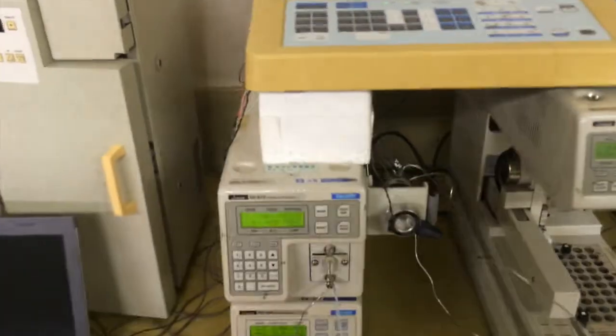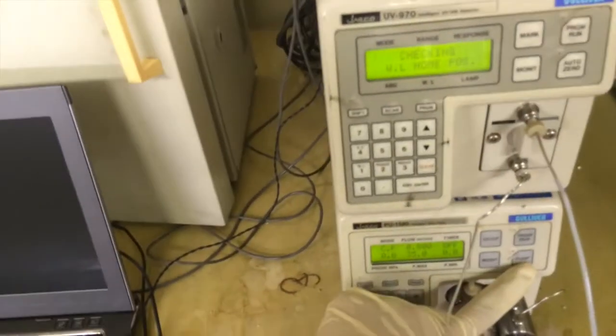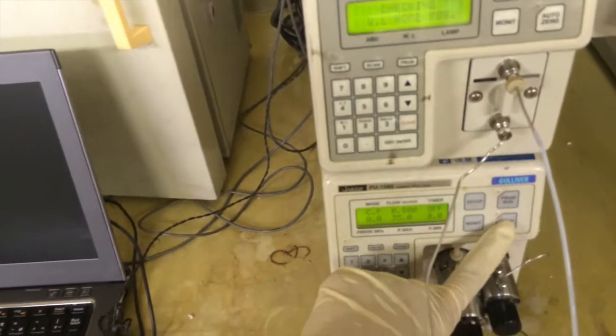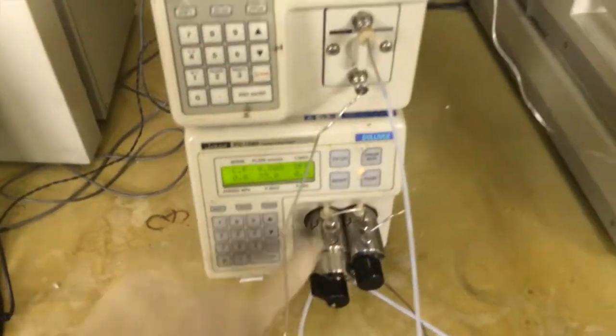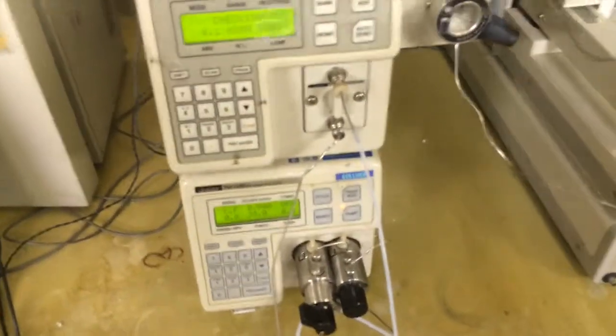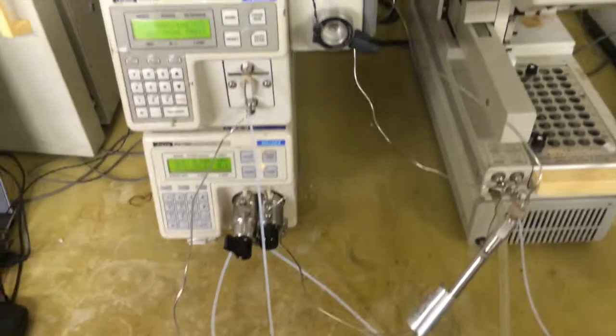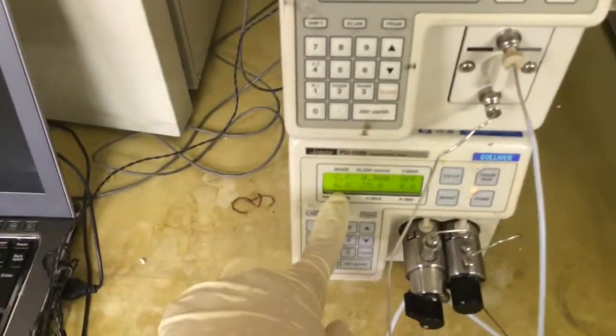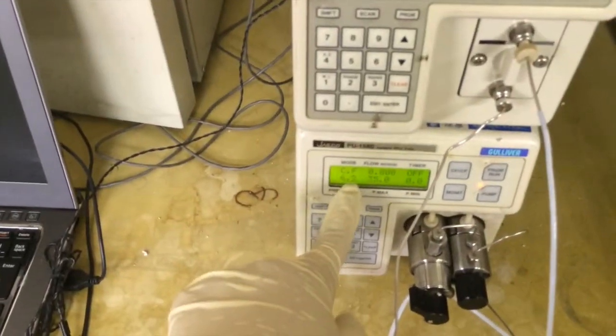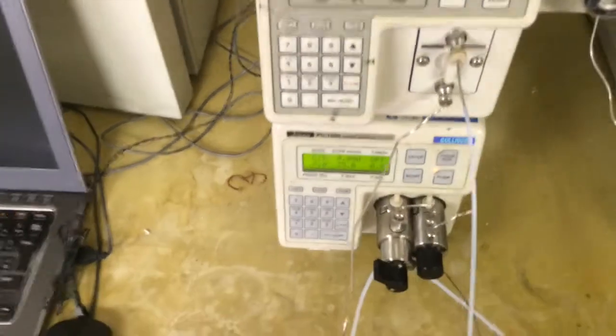Now we can start the pump. Switch on the pump. This is the display for the pressure.